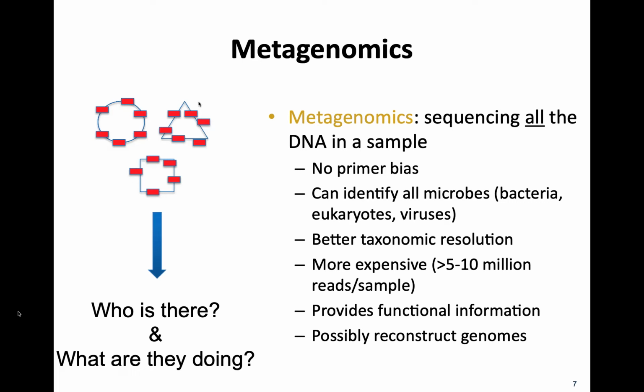I always like to say though, back in 454 days, people were doing metagenomics with like 500,000 reads, right? So environmental sampling, which I don't think there's too many here, obviously you're doing a lot more depth. Definitely see people doing 100 million reads per sample. Seems most people are pretty comfortable with 10 million or more in that range. Absolutely. That's if we're talking about stool where you're going to get basically 100% microbial reads. If you're talking about some other site where you're tossing 80% of the reads, then you're essentially trying to account for that. And people will do less sometimes.